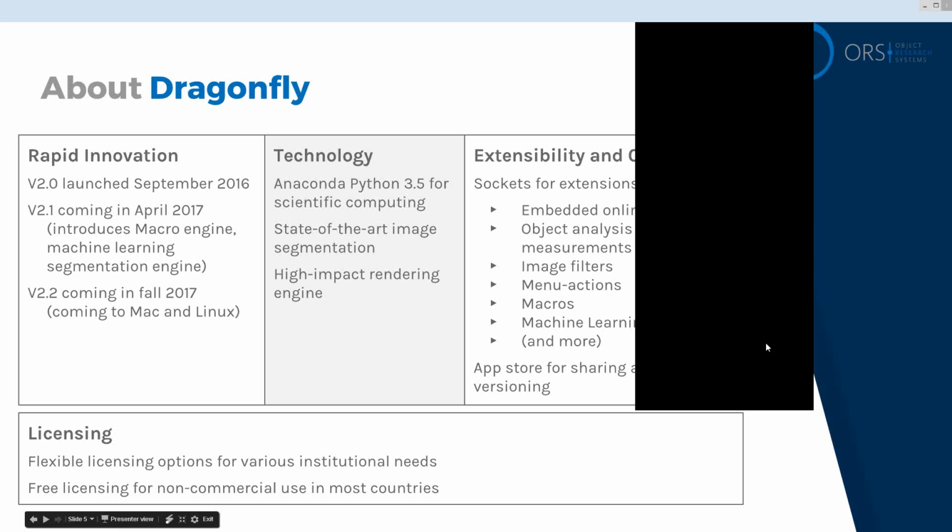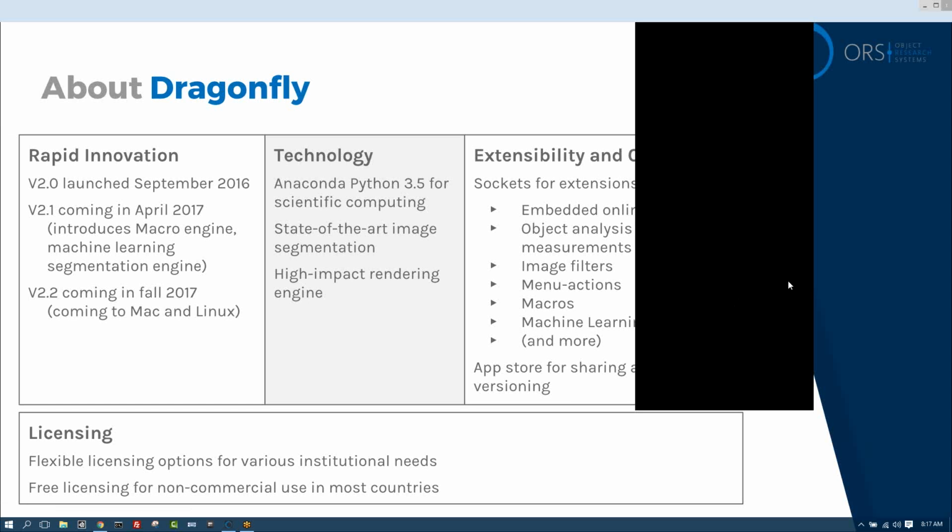Oh, okay. Yeah, I'd prefer using the points rather than lengths, because lengths are easy to calculate from points, and usually these days we don't mess with lengths. We don't use lengths anyway.